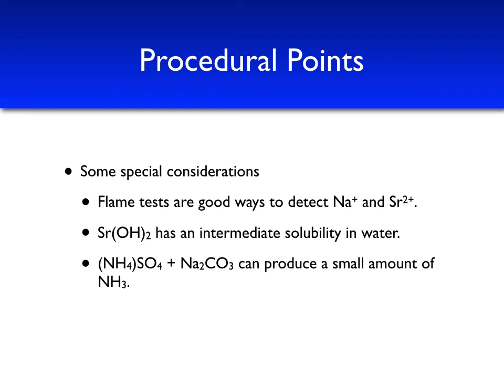And this is because sodium carbonate is a much weaker base than sodium hydroxide. So therefore, we may or may not note an odor from a combination of these two. Just a few notes to help you to identify your unknowns in part 1.